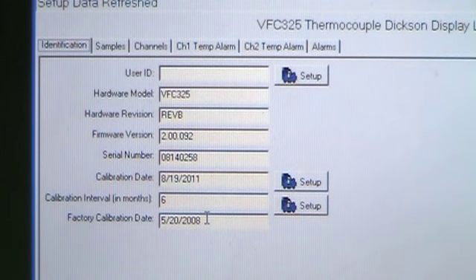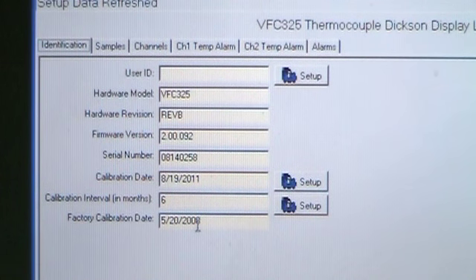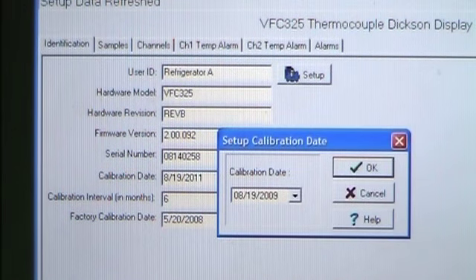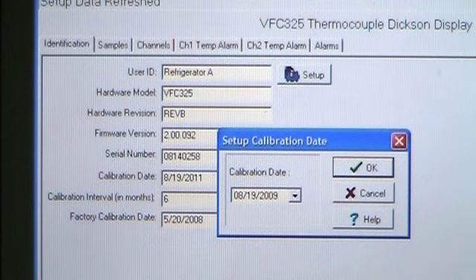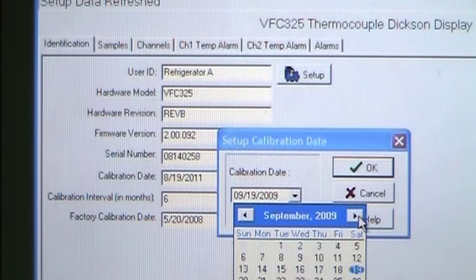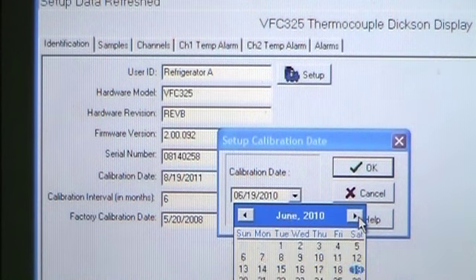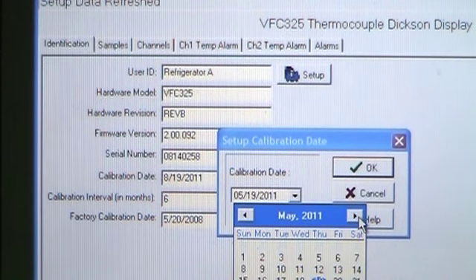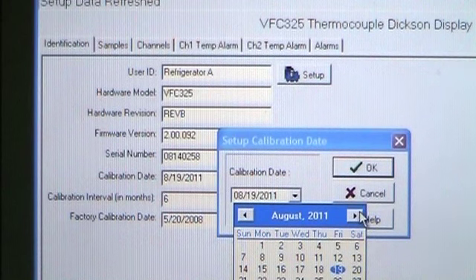Should all fields remain blank, refer to the no communication section in the troubleshooting section of this manual. Choose the Setup button for calibration date and change it to a date two years from when you are setting up this logger, then hit OK.